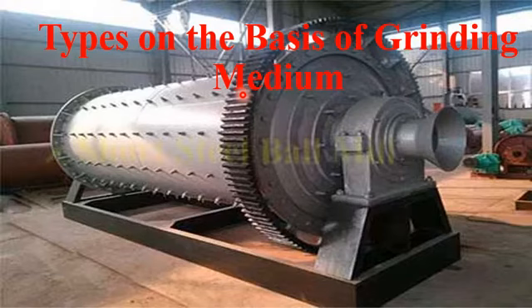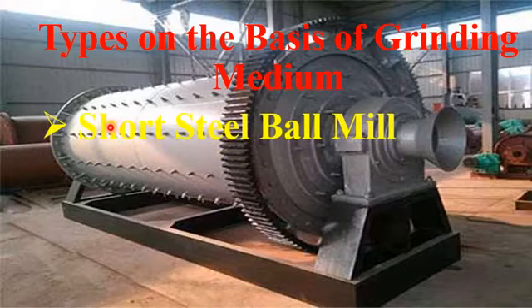Okay, the most commonly used grinding medium ball mill apparatuses are steel ball mill apparatuses. The steel ball mill apparatuses have high grinding force and stable speed, so this type of ball milling machine is very commonly used in very fine grinding because they use very high force and stable speed.